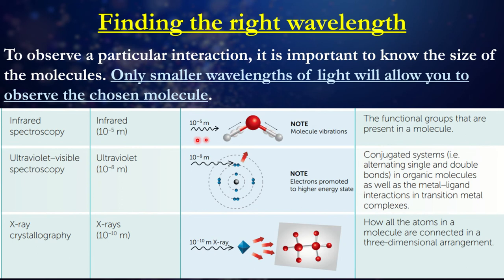Now, just to give you quick pointers, the infrared spectra actually uses infrared radiation that will eventually collide with the molecule. That radiation is absorbed by the molecule and it's projected as the energy of vibration for these particles or of these bonds.